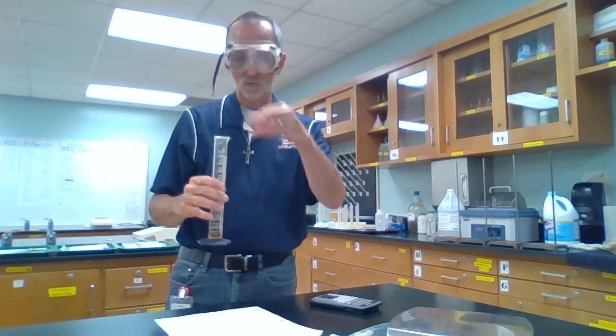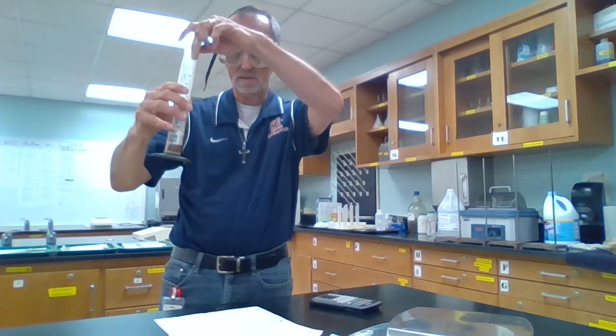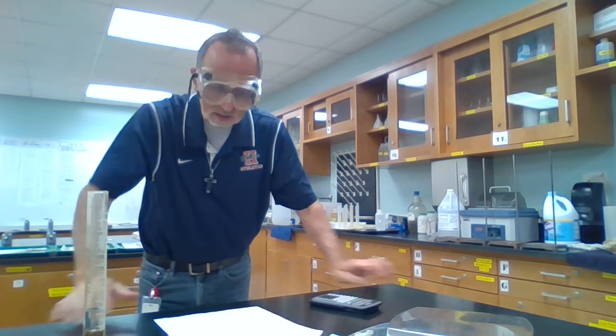Let's get the last 4 in there to 13 and see if we can close this baby out. Well, you know what? To me, that looks like about 24.5, and we start at 20.0. So I'm going to say 4.5 mLs again. Let me scan through. Man, they came out the same.